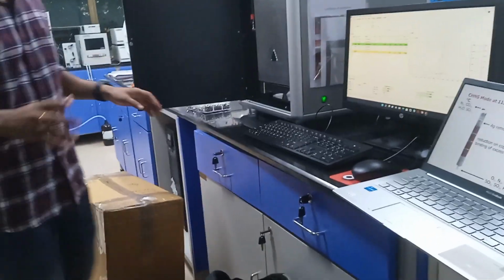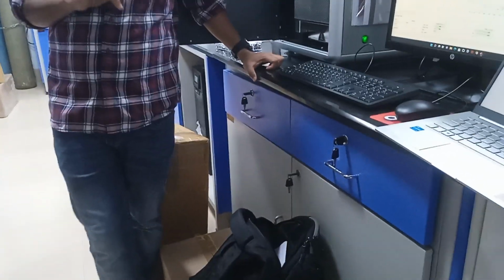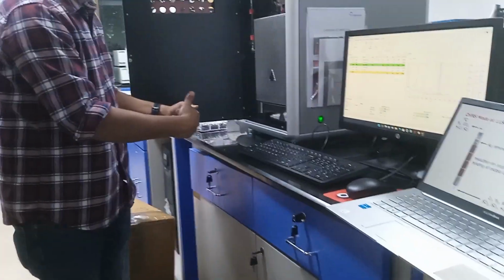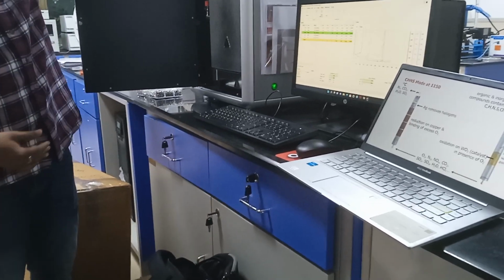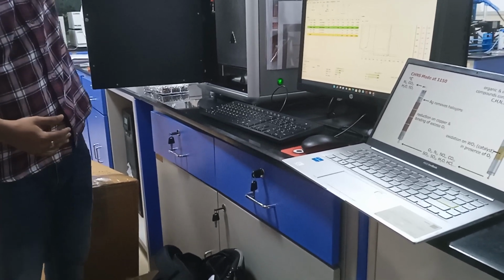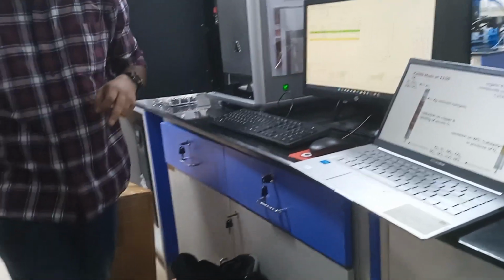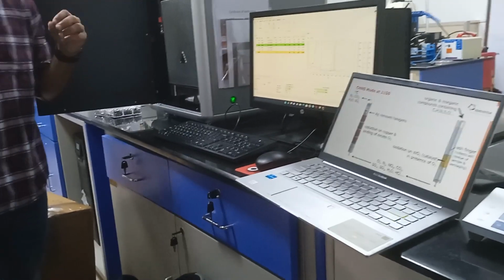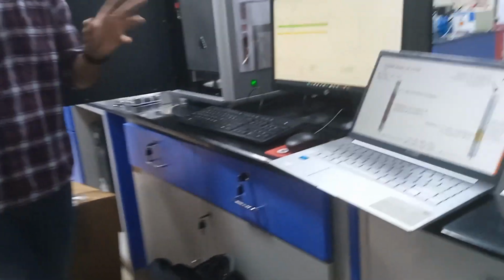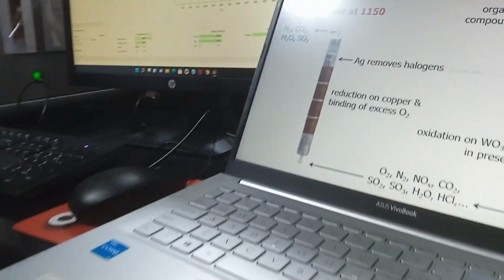I cannot say exactly, it is roughly around 1,000 samples. It's just like a bike. Once you start, pull out the tubes from the furnace usually and check whether it is consumed. If consumed, it will turn black, because copper oxide is black. Now it is copper pinkish color. It will change to black when it oxidizes.